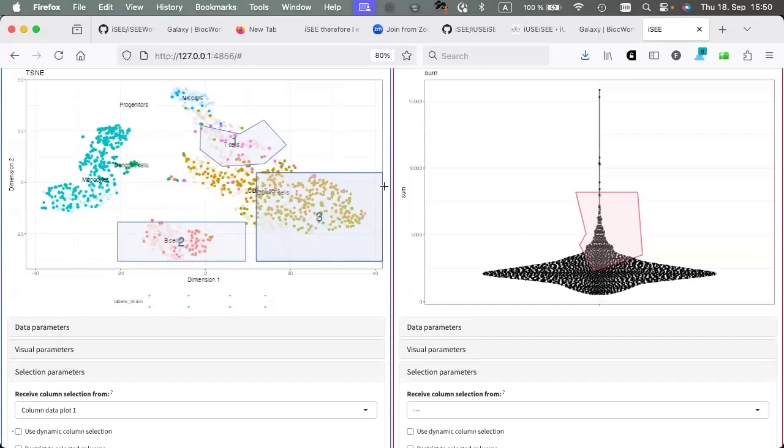Yeah, proof of concept by Pierre-Luc. Someone was brave enough to venture into that some time ago. True. Yeah. You literally just implied it 20 seconds ago, and everyone may not be familiar enough with iSEE to know it. So we're kind of jumping a few chapters forward.